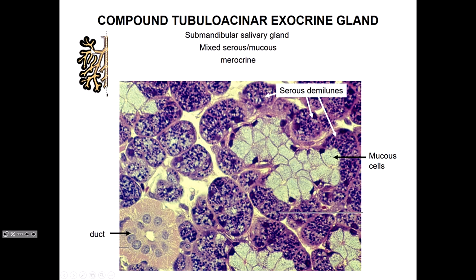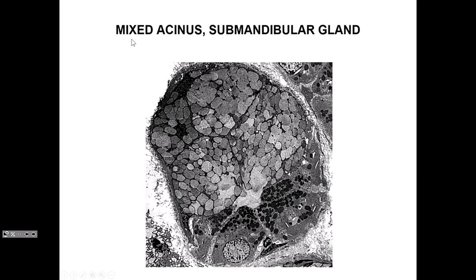It might be cut through here, maybe, because these secretory components can be all over the place. It's just captured everything. It's out here somewhere. It's not up here where you've got the big duct. It's down here where we've got little duct. Okay. Other questions?